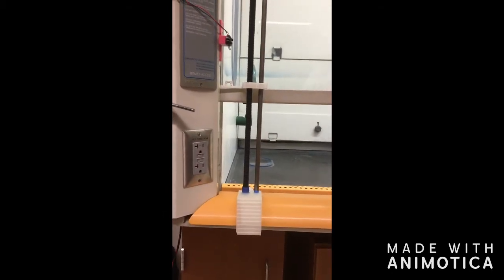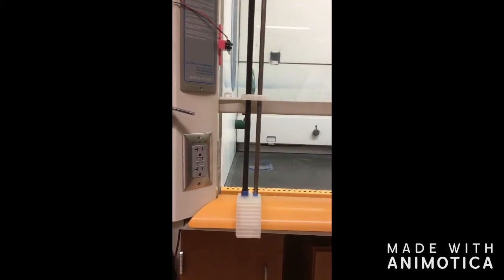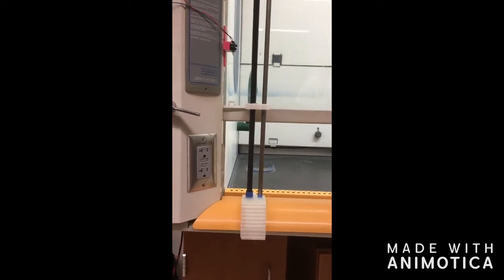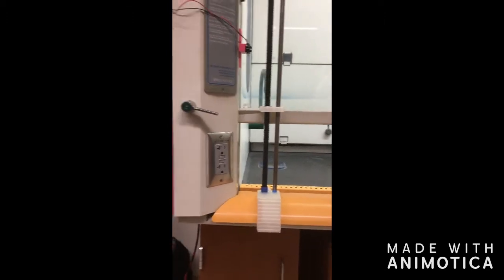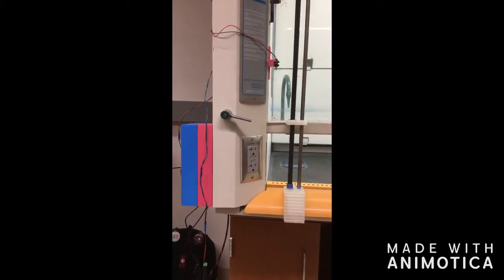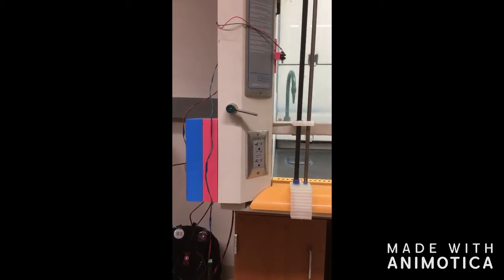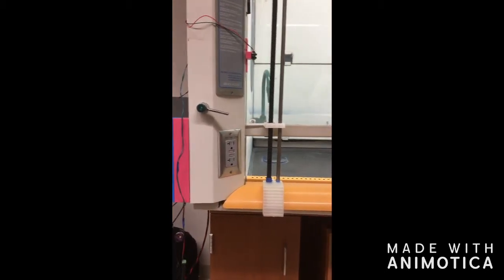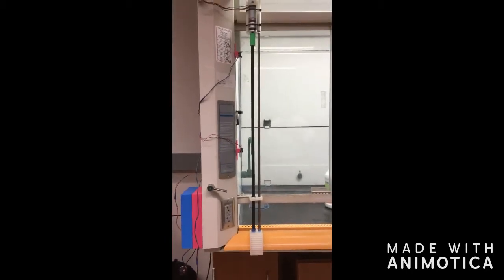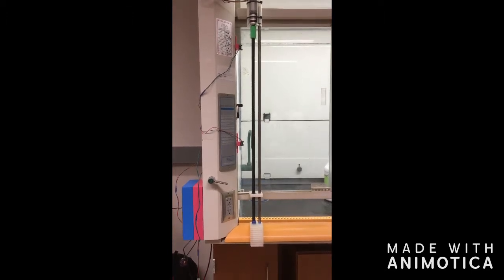We evaluated the extent to which our device met the design criteria by measuring its compactness and ease of installation, testing the consistency of the control program, and fielding user feedback. We wanted our device to be compact so that it would not limit accessibility to the inside of the fume hood. Originally, we discerned that the device should not extend out more than 2 inches from the face of the fume hood for all regions of the hood. Additionally, the device should not extend more than 4 inches out from the frame of the hood. This was tested by measuring local maxima with a ruler.